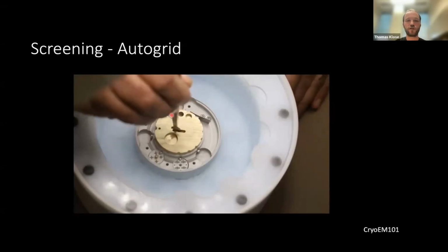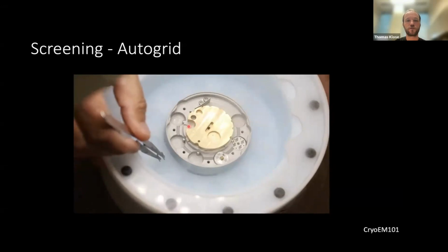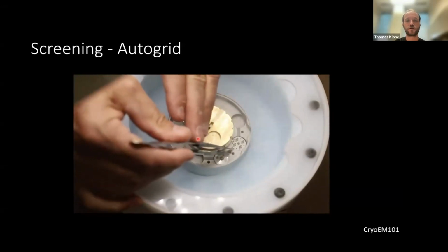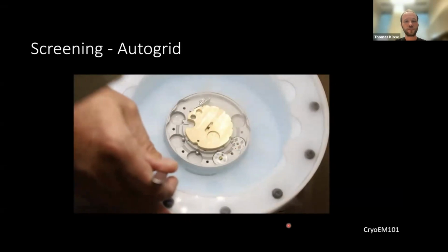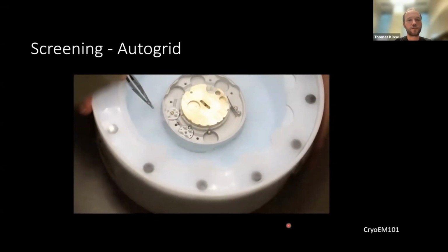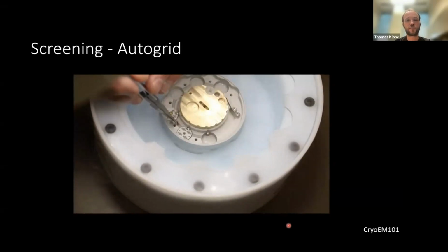So now they are going to rotate back and use special tweezers that are slightly differently designed to now take this grid assembly out of this position and put it into this second grid box that is over here. And then the sample is ready to be transferred to the loading station for the robotic system.